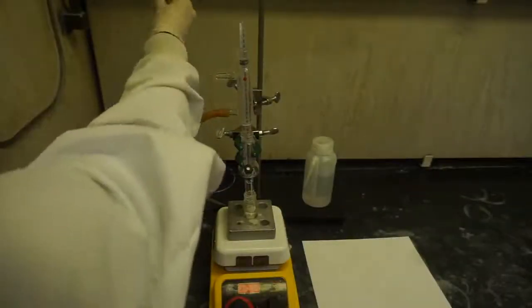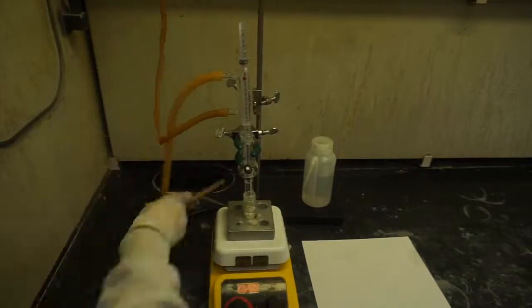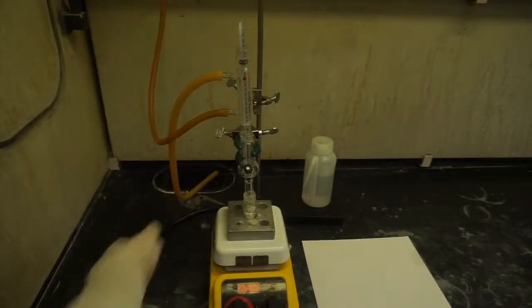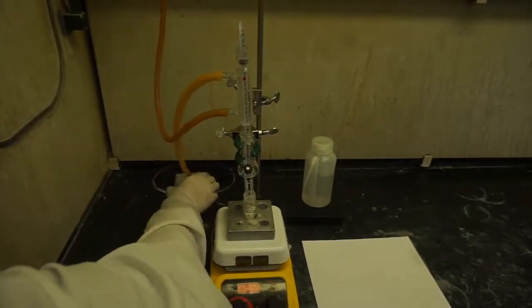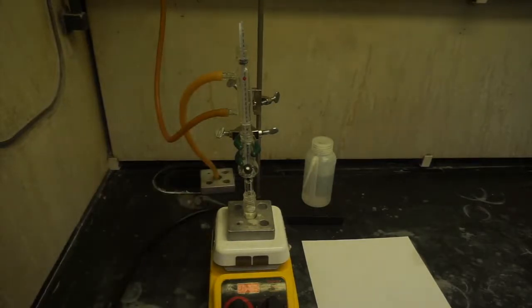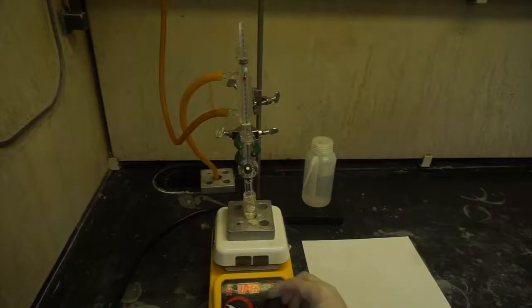Attach the latex tubings to the inlet and outlet of the condenser. Start heating the mixture and make sure the water is running inside the condenser. Also, don't forget to stir the solution on the hot plate.